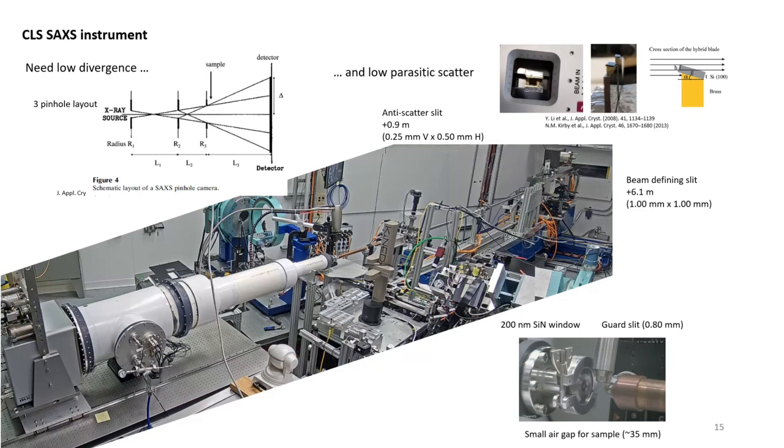And not only do you need this particular slit arrangement, you also get scattering from the slits themselves, so you have to modify them to have less scatter. We do that by gluing little single crystals at a specific angle for our specific wavelength and distance, so that if they do scatter, it's at angles that are nowhere near our detector. It really cleans up the beam nicely. So that's all the upstream part up here. Then the sample region is over here.